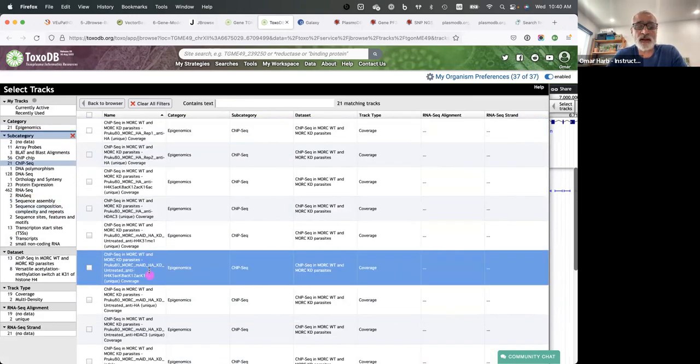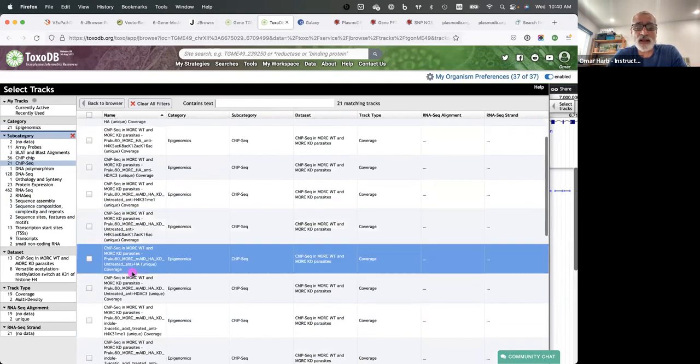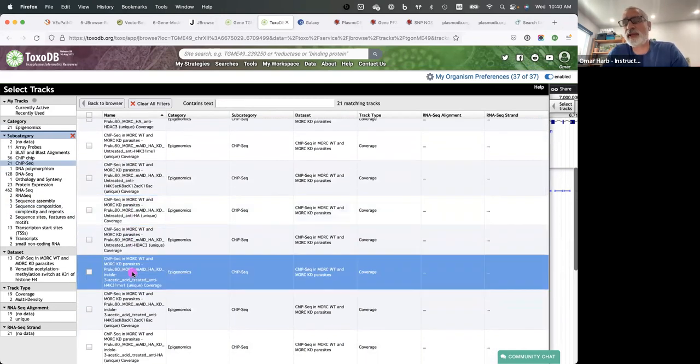And then looking here, you can start taking a look at these. ChIP-seq is basically a chromatin immunoprecipitation followed by sequencing. And basically what you're doing is you're cross-linking different histones or DNA binding proteins to the DNA. So you're basically freezing the status of the epigenome, and then using an antibody specific to the protein that you're interested in.